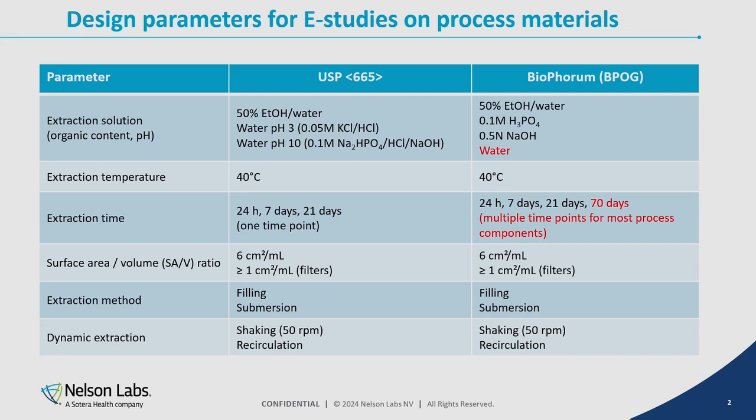With regard to extraction time, USP 665 has 3 time points, 24 hours, 7 days, or 21 days, and only one time point should be tested according to that protocol. With regard to BPOG, there is an additional time point, 70 days, so that could be interesting if you have long storage applications to take that also into account. And also this guidance recommends for most of the process components at least to also test multiple time points.